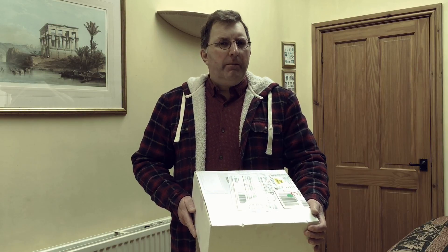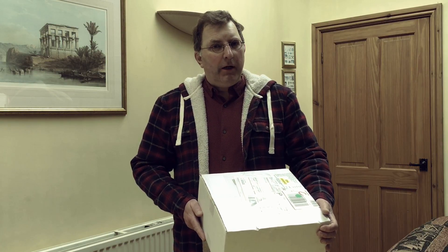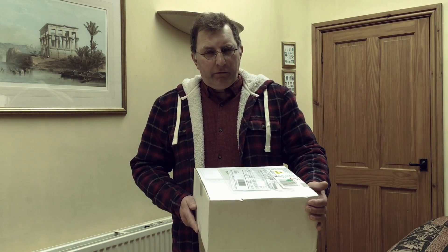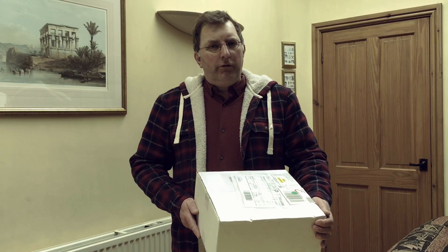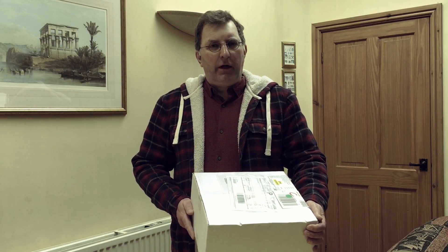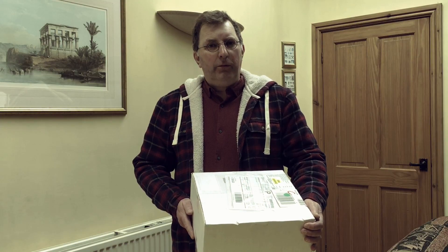It's an American startup that aims to make biohacking easier and more affordable. So I ordered their CRISPR kit, and I'll put on the video what CRISPR stands for, but basically it's a relatively new genetic engineering technique that makes it possible to do very precise edits to DNA.